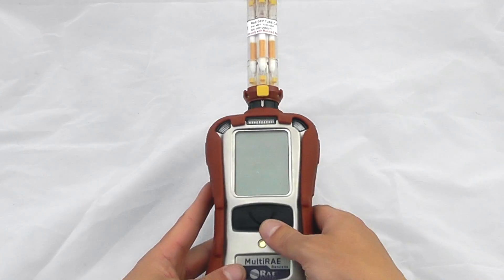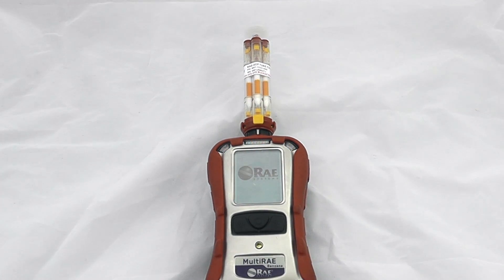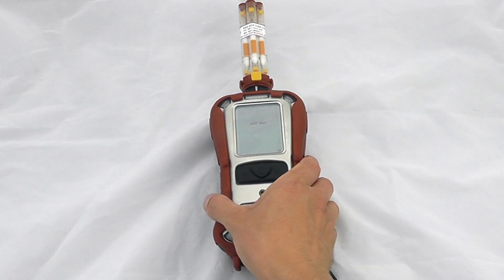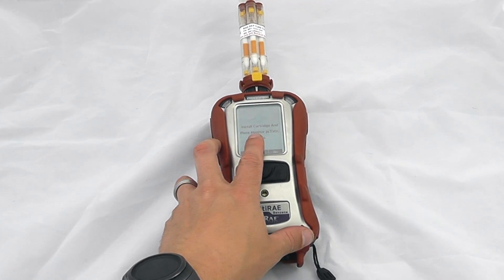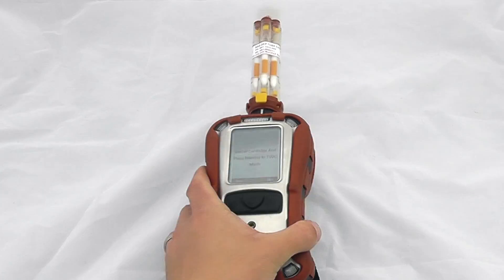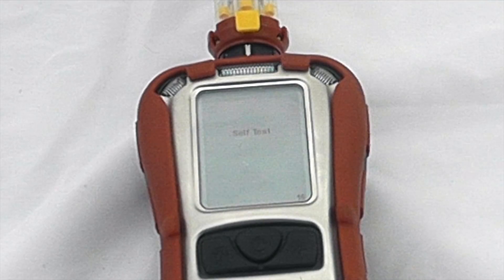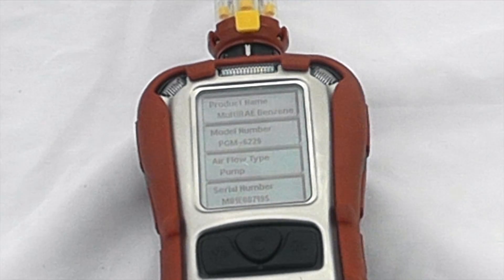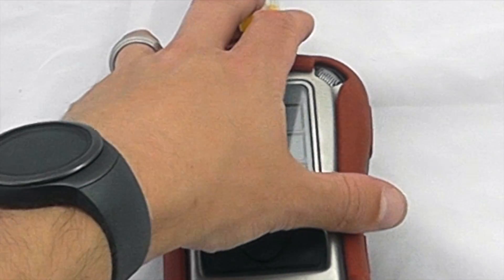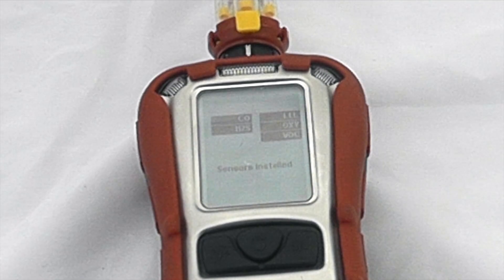To operate the instrument, we'll turn it on and it will go through its standard startup procedure. Firstly it lets us know to install the cartridge and place the monitor in TVOC mode — we can see we are in TVOC mode at the moment. We acknowledge that, and that purely means the gas is passing through the central column of the instrument, giving it free flow without being impeded by any of the tubes at the top, and it will start the standard startup procedure.